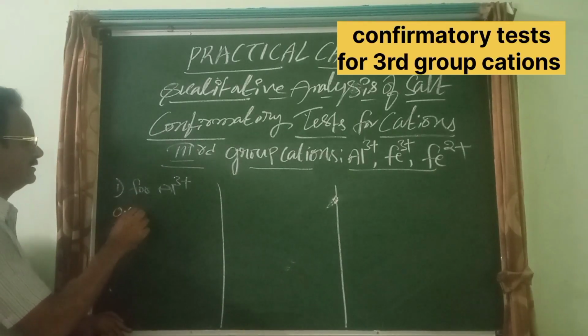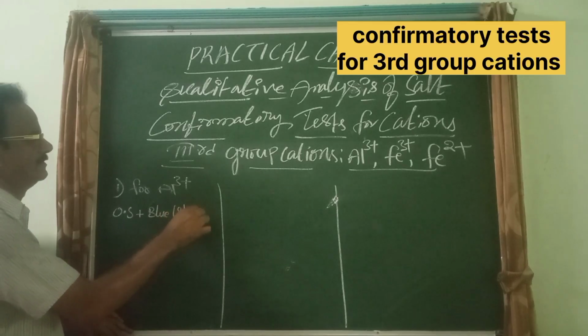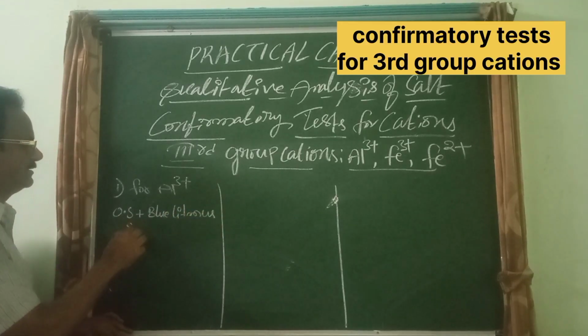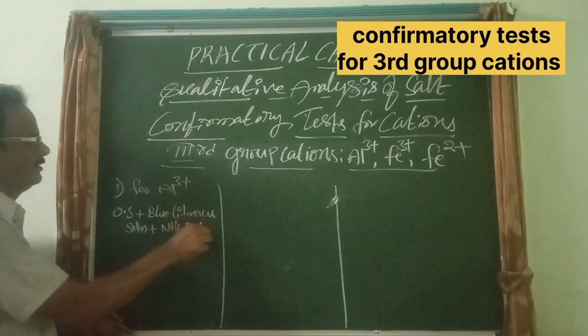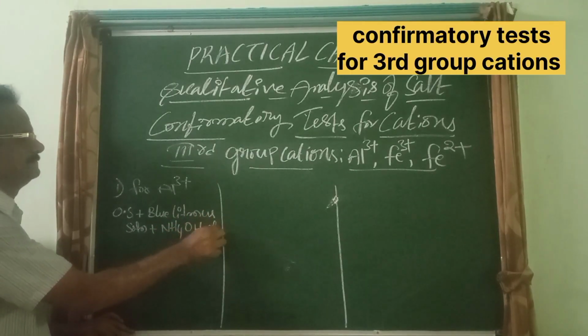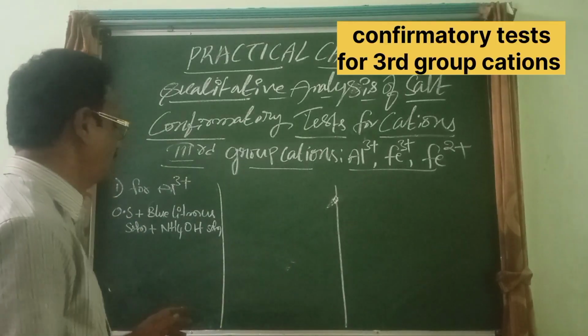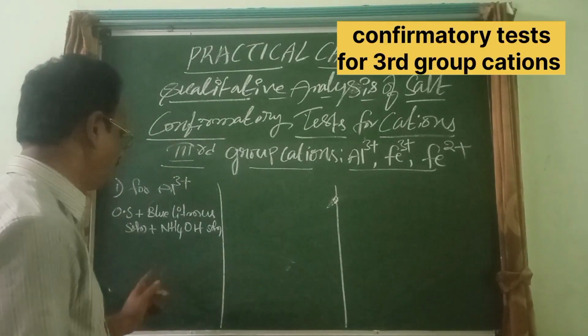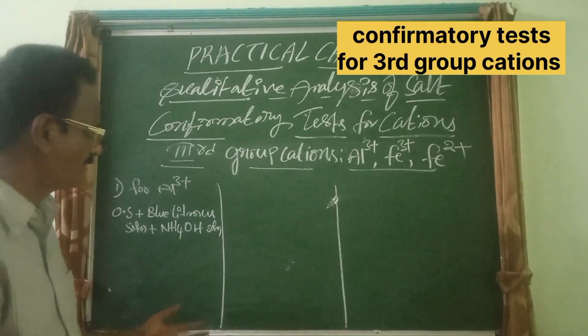Original solution is added with a few drops of blue litmus solution, keep in mind, followed by ammonium hydroxide solution.